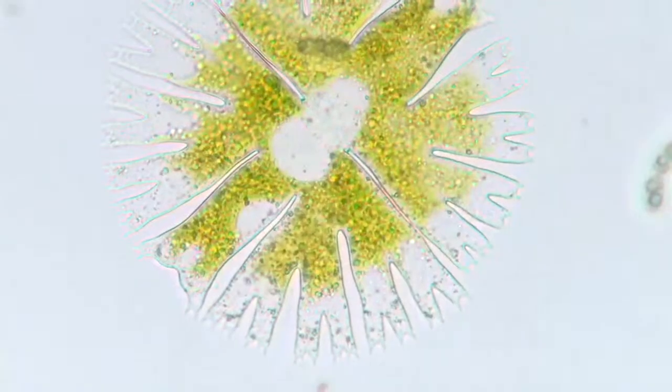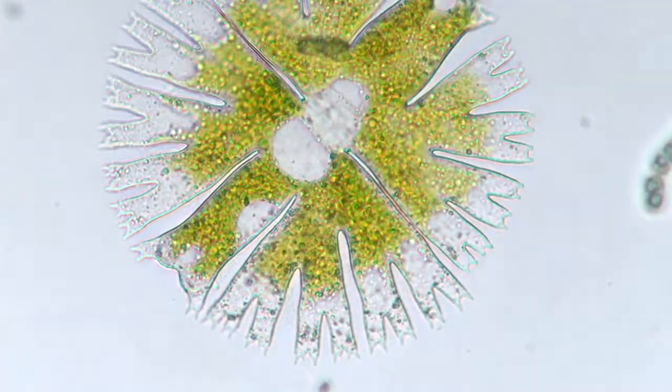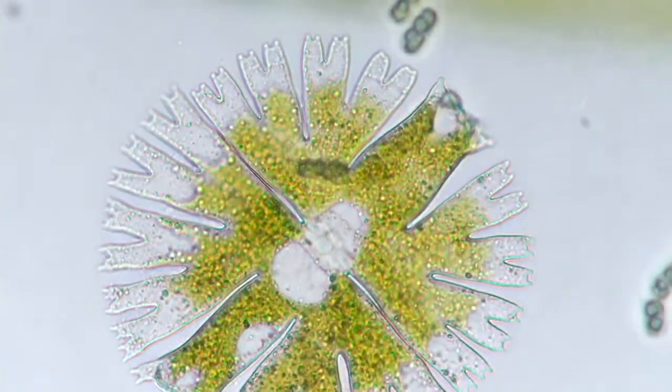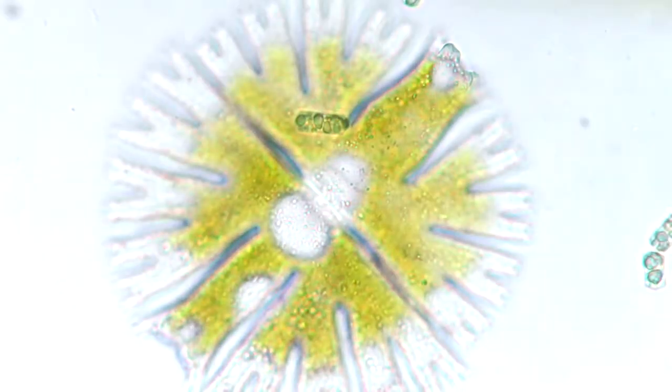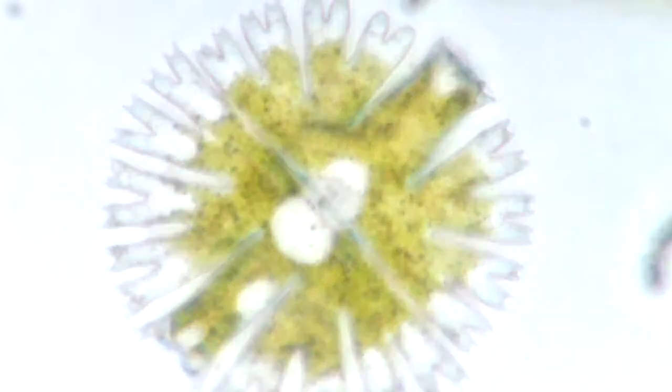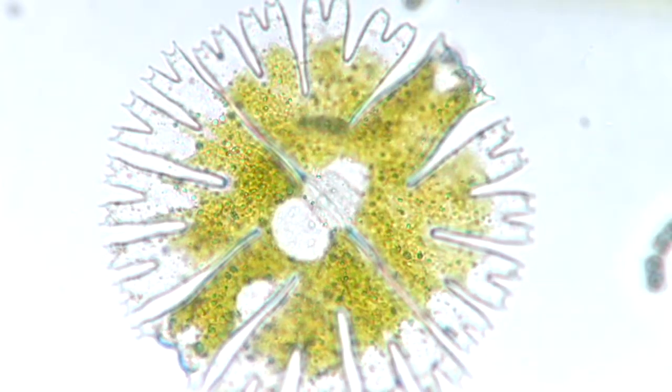Hey, you're quick. Brownian movement, not real movement. What is it? Brownian movement — you're exciting molecules with the light from the microscope.